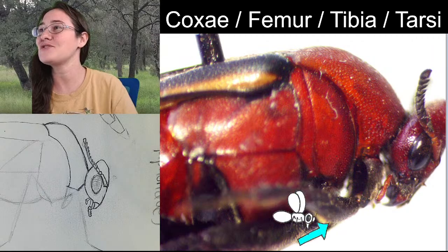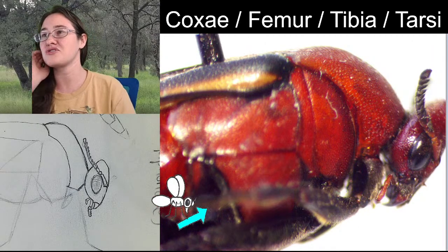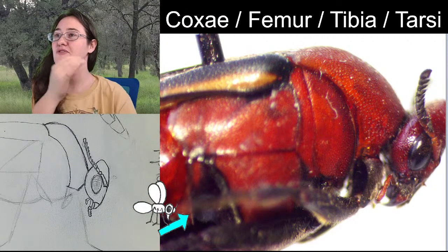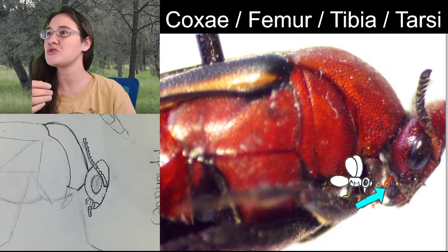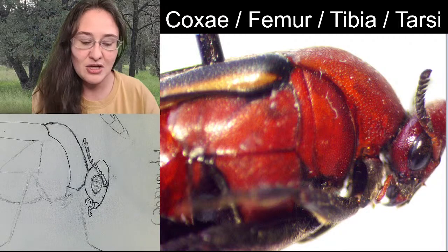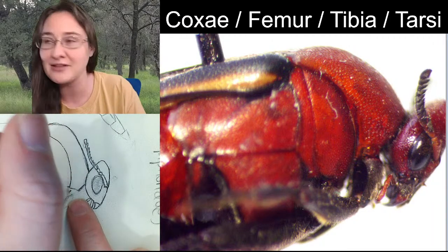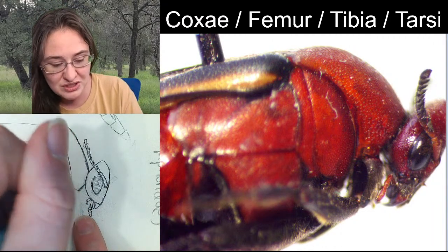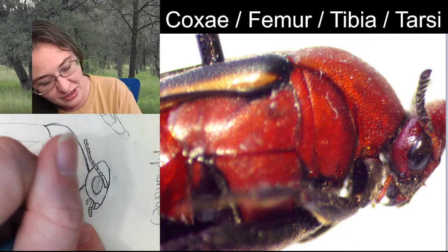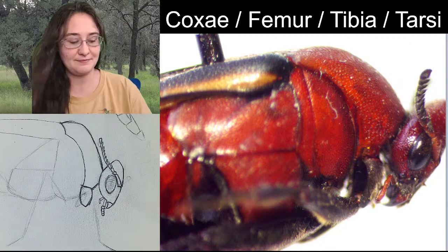And then as we're moving down, this is going to be the femur, the tibia, and then our tarsal segments are over here. We're going to be changing up the focus so that we can see them all. But I just wanted to make sure that you could see how this coxa was connected. So if you start right about here, you can see I ended it kind of bluntly. We're going to take that, and that is where the hip bone gets connected.